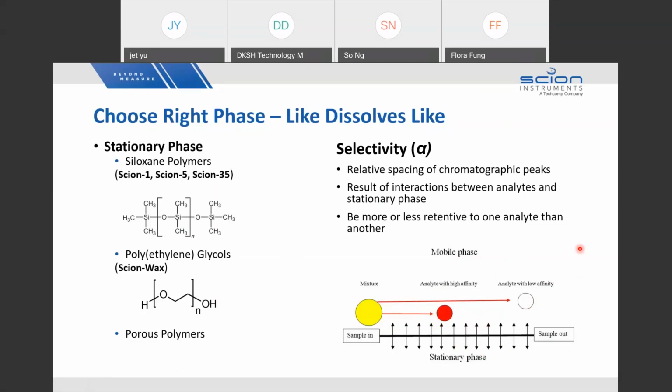Dr. Jett, the same person is asking about a compound suspected to be a mixture of both. And the next question is from the same person: will a highly polar compound be retained permanently in the column and cause contamination or a drop in performance of the column? Will the polar component permanently stay in the column?